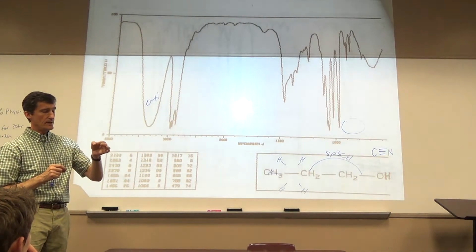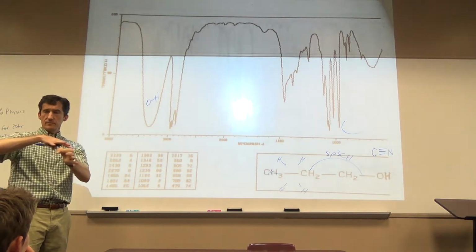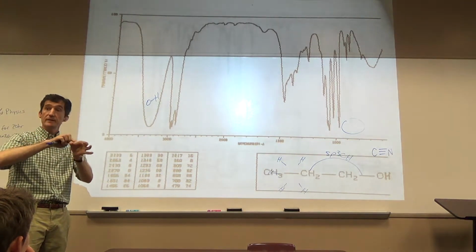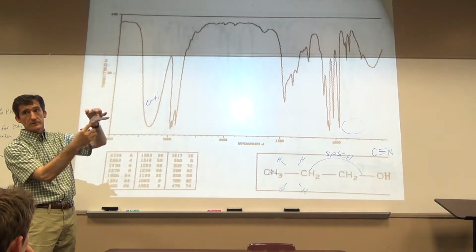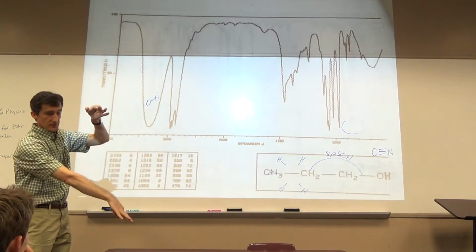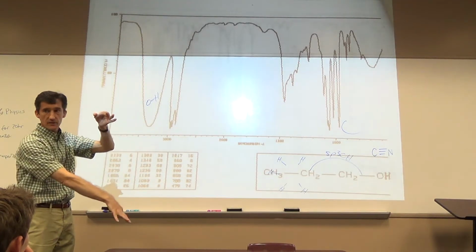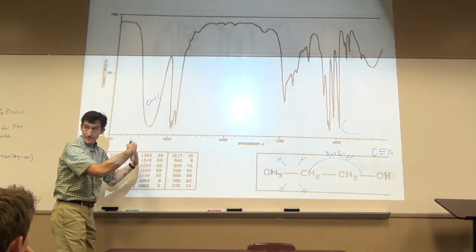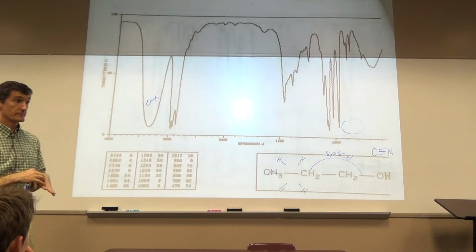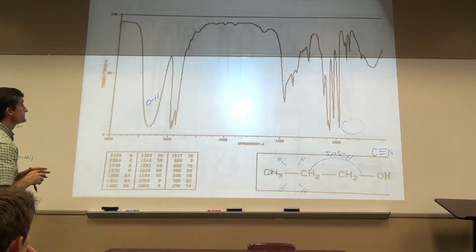Nowadays, the instrument just has a little diamond eye sitting on top of a little shelf, and the light comes up from the bottom. You don't see any of this, and it reflects off. Because it just reflects off, the absorbance on this end is not as intense as it used to be. So you're probably not going to see an OH this intense upstairs.